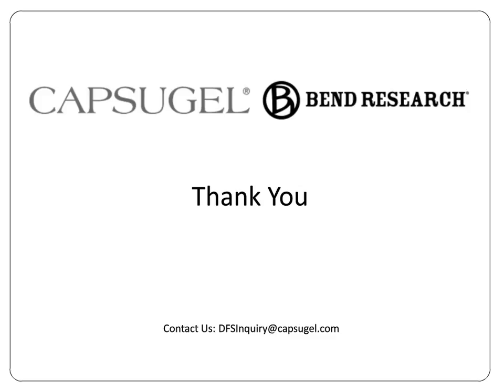Thank you. Next one is, how long is the development time? Yeah, I think the thing to say there is that it really depends on how fast the dynamics are that you're measuring. So in the case of this percent galactosylation, we were seeing settling times that were on the order of days. So that means that essentially you're looking at several days per condition for this study.